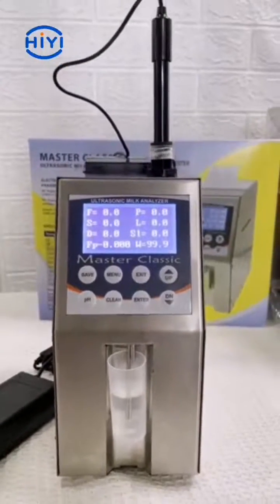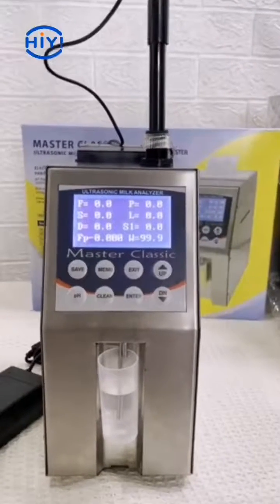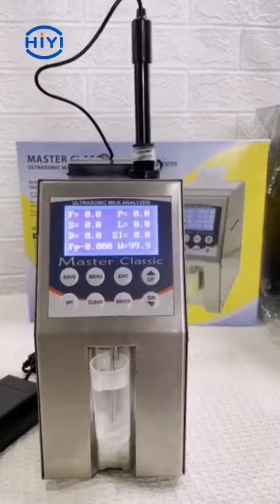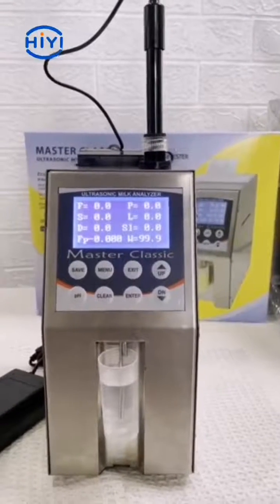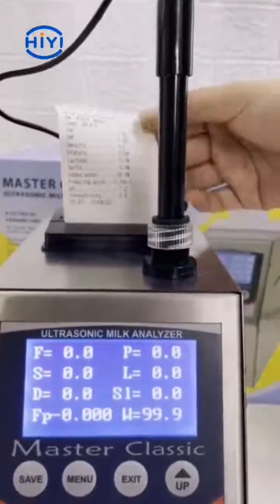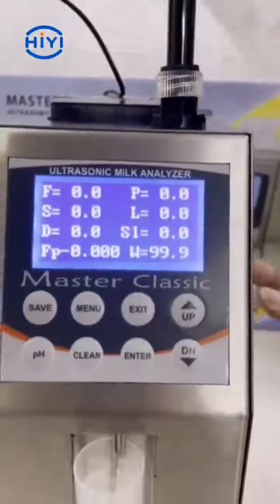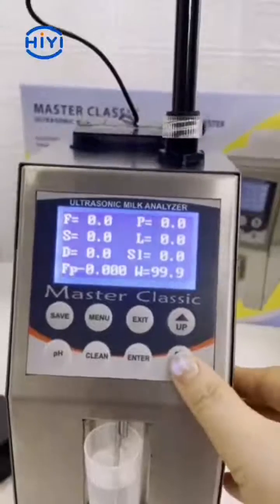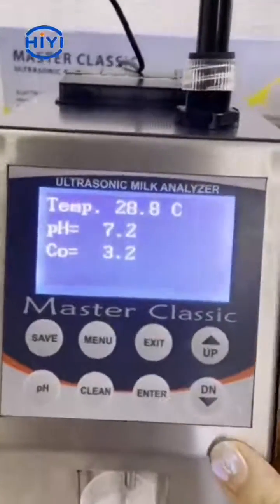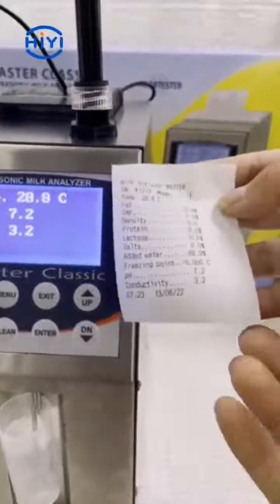Now we got the test result. The result will be printed automatically from the internal printer. And if we press the down button, we could see the result in the next page — page conductivity tempo. And here is the result.